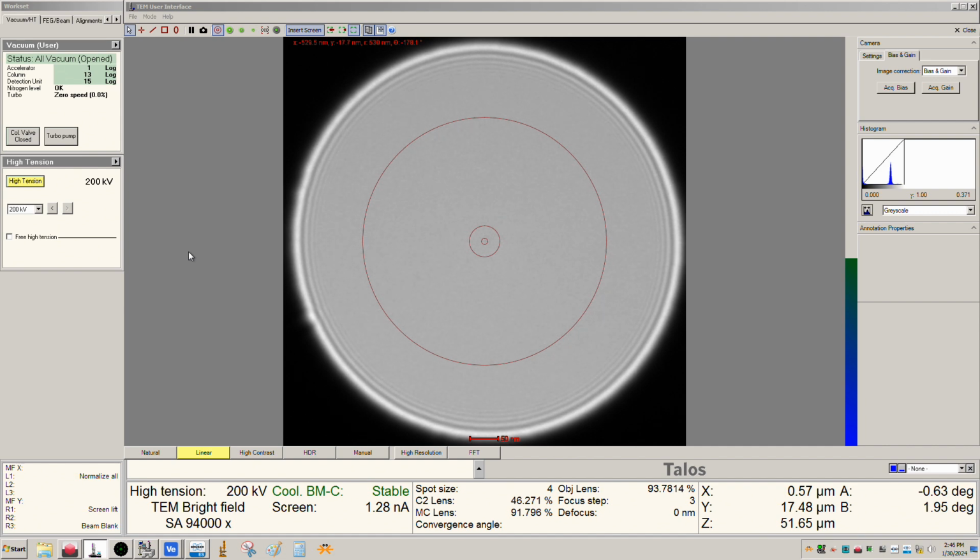The sample I have in here is as close to a perfect sample as I have. It's a silicon sample, oriented so we're going to be looking along the most studied zone axis ever, 110. And it is prepared, I think, exclusively by precision mechanical polishing. So it should have basically no damage layer from any sort of ion beam process, whether that's FIB, ion milling, anything like that. So basically only an oxidation layer.